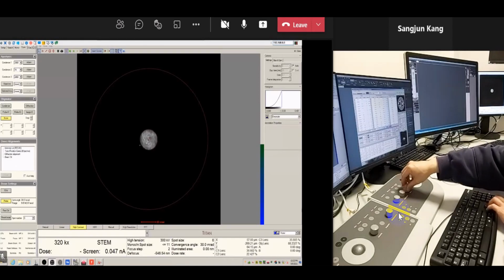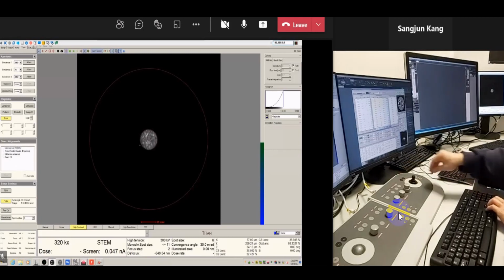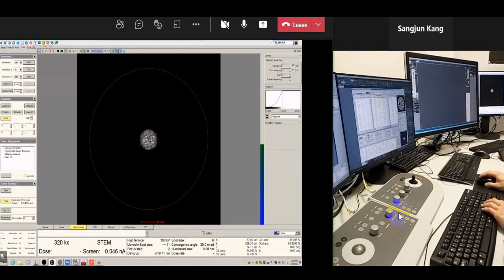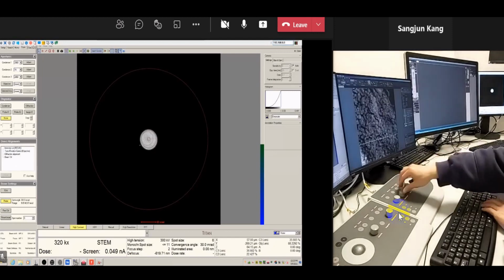You already get our two big steps. Yeah. I think B2 is nearly perfect. Let's see the image. It gets much better, right?